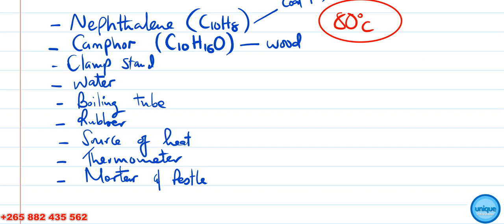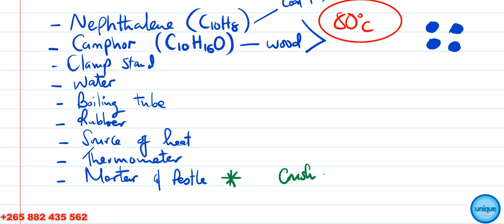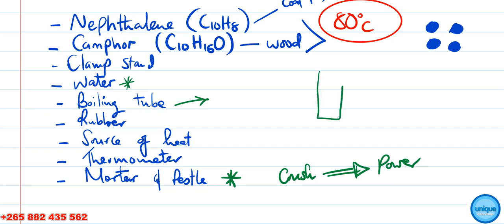In terms of procedures, the naphthalene comes in solid state — something like tablets. We're going to use the mortar and pestle to crush these into smaller pieces. Then we place them into the boiling tube.